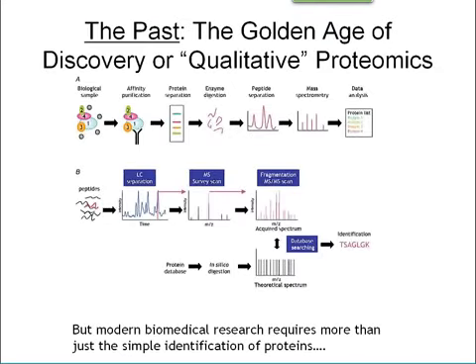In the past, we've really concentrated on the identification of proteins, and indeed proteomics has surrounded itself with identification for the better part of a decade. And though incredibly powerful, to be useful, proteomics requires you to not only know what the protein is, but how much is there, especially if you're comparing, say, a cancer cell to a non-cancer cell.